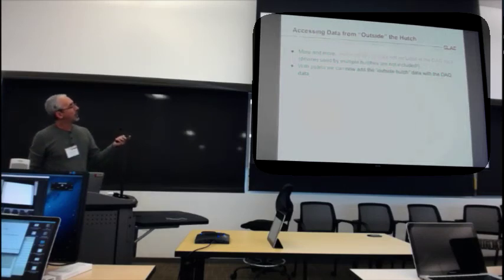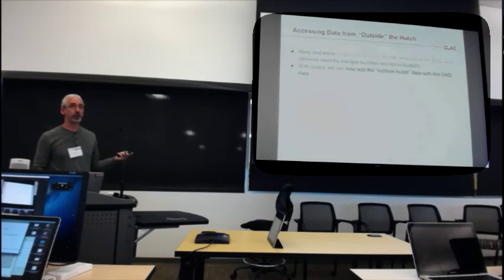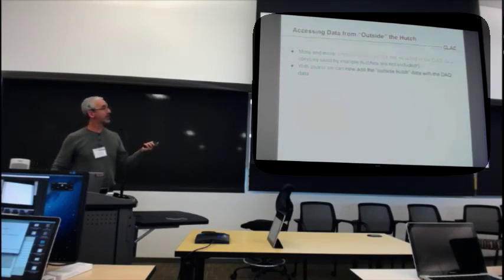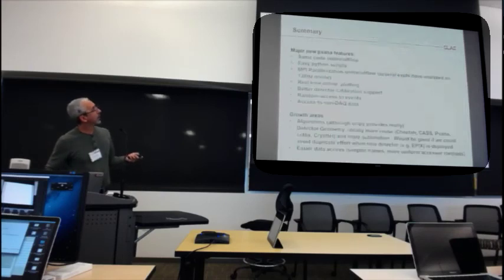And this is going to happen, I think, more and more. And with Psana, you can see this outside hutch data, which I know Mohammed wanted for his experiment. It wasn't quite ready when you tried to do it, but it is now ready. So keep in mind, this is a hard problem, joining this outside hutch data together with the DAQ data. This is not trivial, because it turns out the timestamps are different because of the messed up timing system, which I talked about before. Okay, I think that's it.